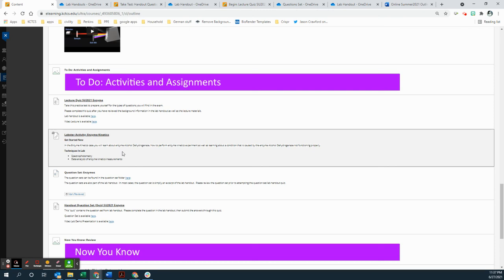I talked to you in very basic terms about how to think about enzymes and enzyme activity and how to measure it. Look at my videos because I'm trying to explain it to you in terms of a tool, and I think of enzymes as a turnstile that allows people to go through. It works pretty well on a very basic level to understand what happens if you add more enzyme, what happens if you add more substrate, and those kinds of things. So I want you to think a little bit about that.